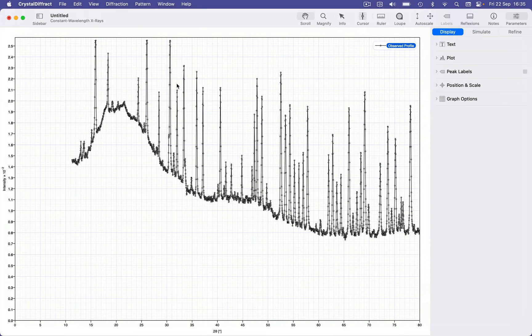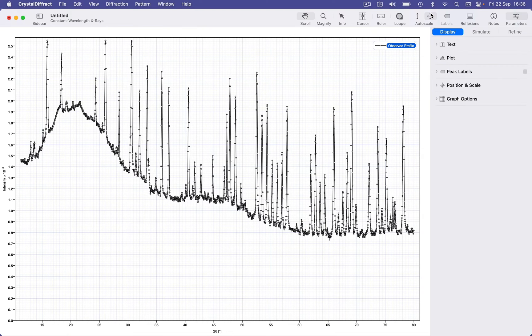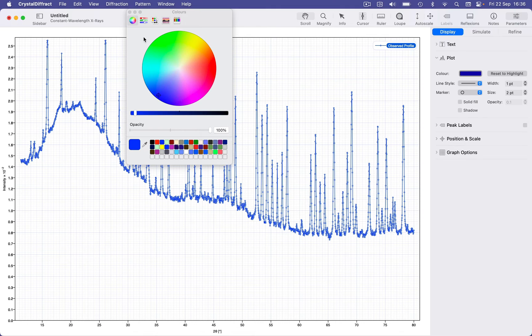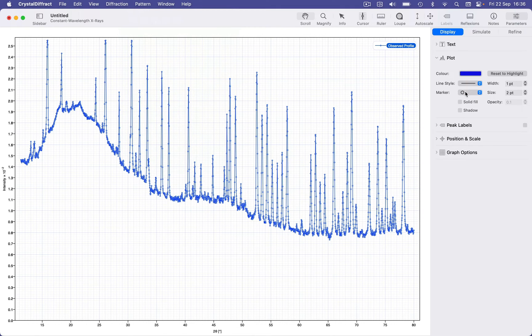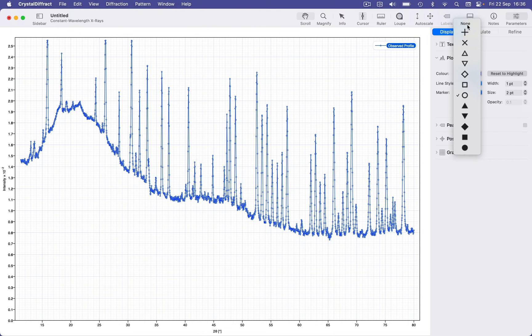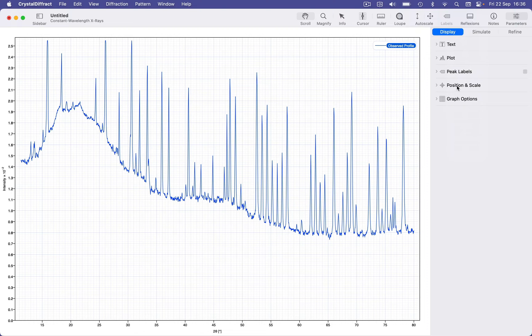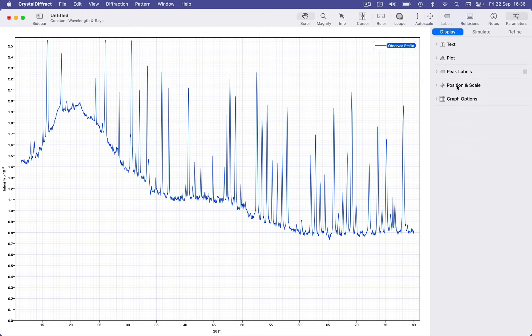Before we do anything else, you might just want to auto-scale the pattern by clicking the auto-scale button in the toolbar. Next, we might want to adjust the display settings, and we can use the display inspector to do this. Let's set the plot color and the display style — I'm going to turn off the peak markers and just rely on lines between points. We can also use this inspector to adjust the position with an x-offset or a y-offset to the pattern.